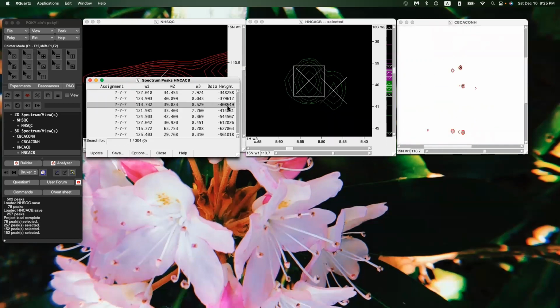Because the most negative values are all peaks, you want to look at the smallest negative value and the smallest positive value. So if we scroll up this list, we can get to where the negative value changes to positive value, and look around that region, that range. A little bit higher, or we can just use our mouse and find it. Just find that one. Oh, found it. You see? So this is our smallest negative peak, and this is our smallest positive peak.